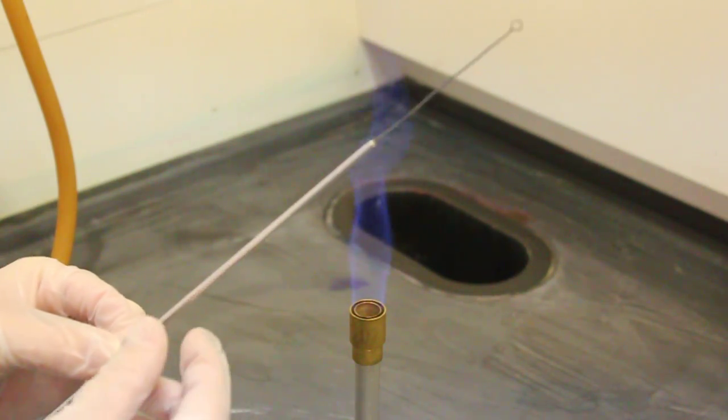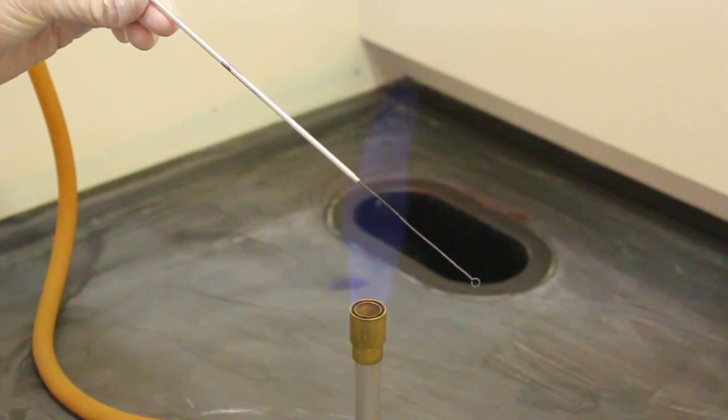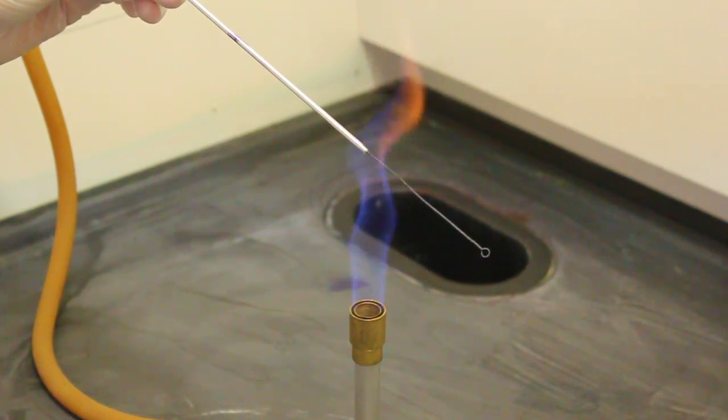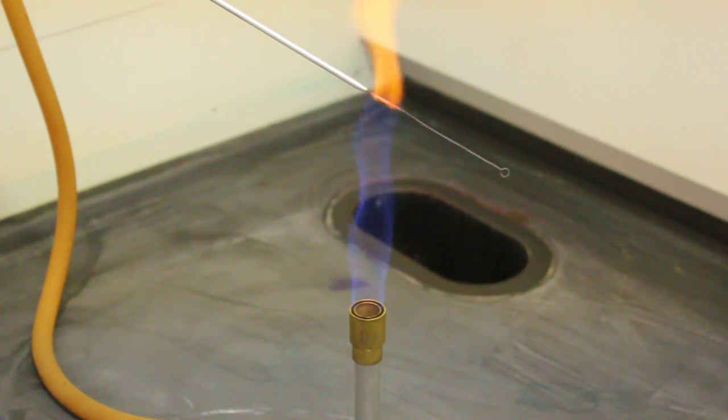When you are first beginning to incinerate your loop, you place the end of the loop that is closest to your hand in the flame. You need to find the location in the fire which turns the wire bright orange.